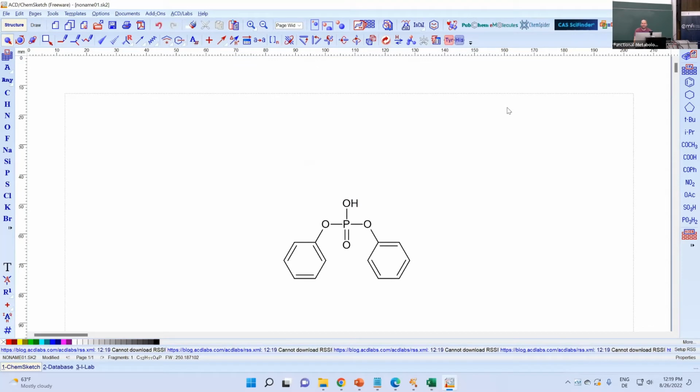And oh, what do you think that could be? I think that looks very much like a plasticizer, or flame retardants often have this type of motifs. So also not necessarily something I would assume should be made by Synechococcus.